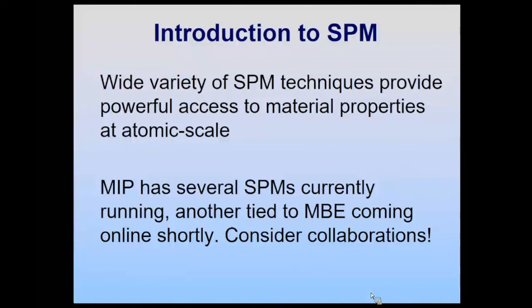Even if you don't use the STM, you can bombard it with something else, which we can. Sure, and so I didn't put in those images, but for example, we're doing a study on helium bombardment of graphene. You can do that and then put it back into the STM and look and see what happened with the atoms that we knocked out. And we're doing that in collaboration with Tanu and John Redwing's group.